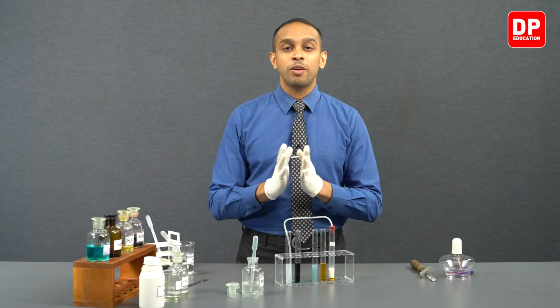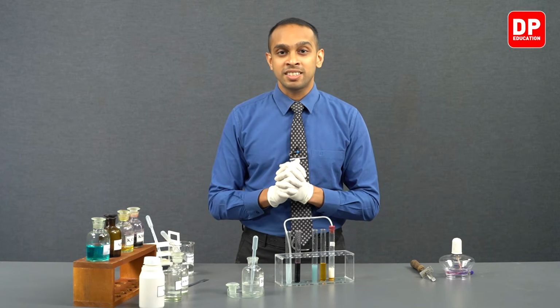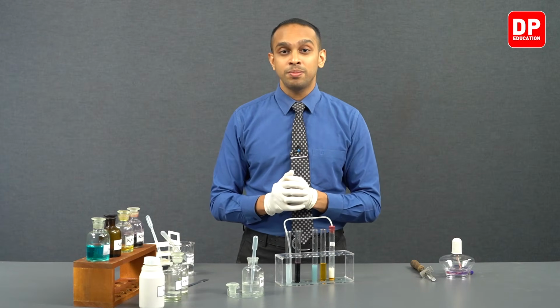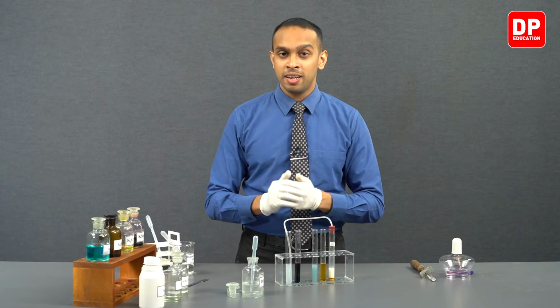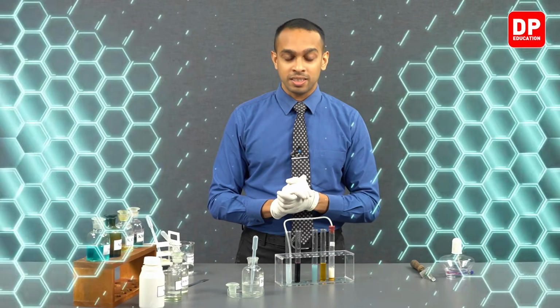So students, now we have observed what happens when hydrogen sulfide is sent through acidified potassium permanganate and acidified potassium dichromate. Let's remove this sample here from the lab as it is still producing hydrogen sulfide, and we will come to discuss the color changes further after that.